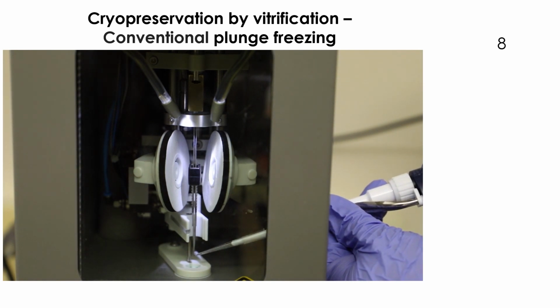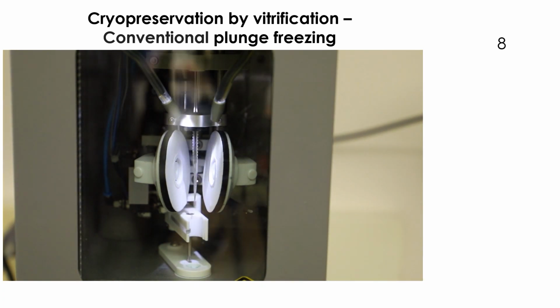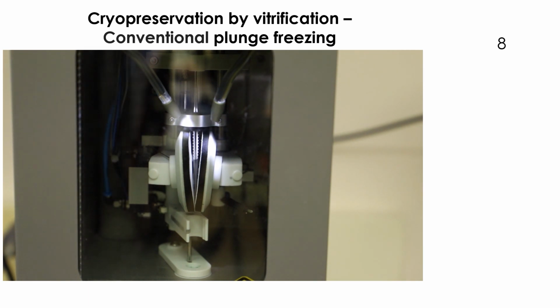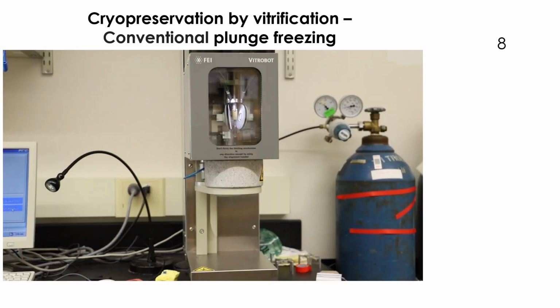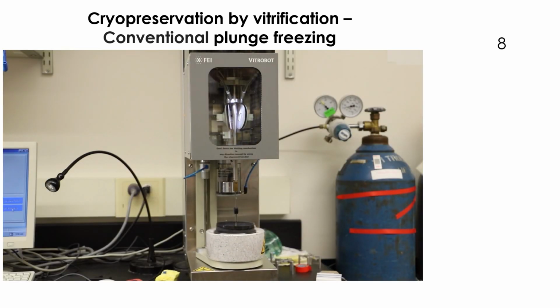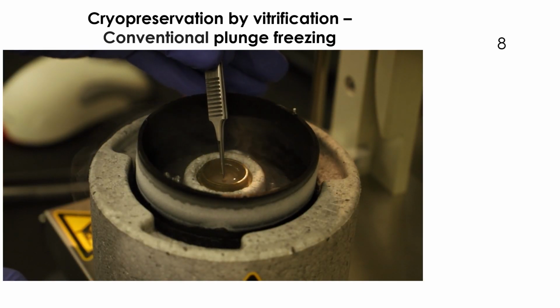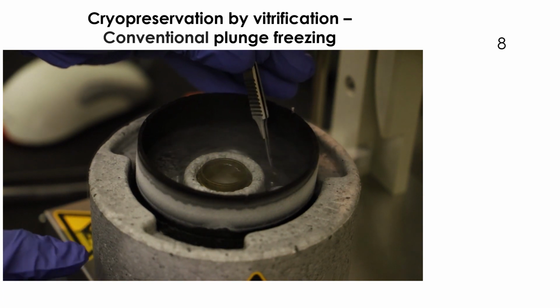A few microliters of sample are applied to the grid, after which the grid is blotted by the blotting pads and immediately plunge frozen into the ethane. Finally, the grid is carefully transferred from the ethane to the grid box.